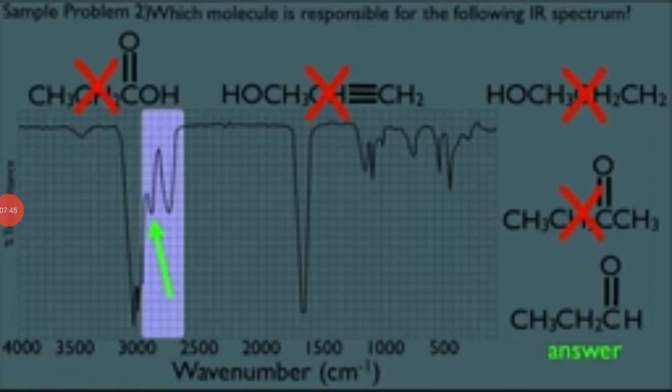So this way you can follow the strategy that when you are provided with a spectra and some molecules, just follow the elimination rule, where the compound which is not possible, we just try to rule out. This is the best way to identify the compound and to compare the spectra.